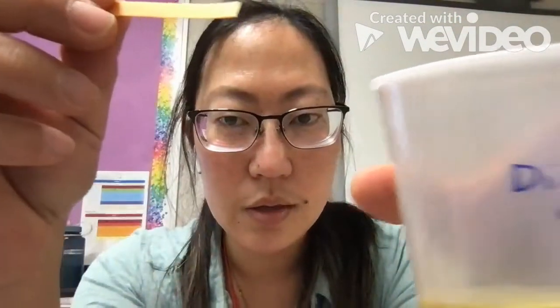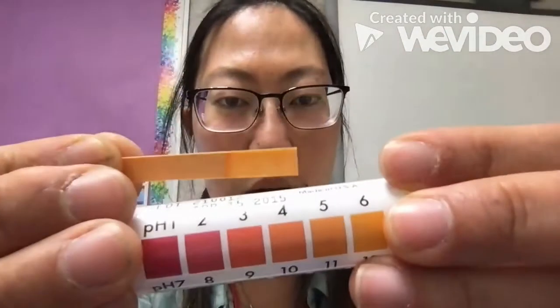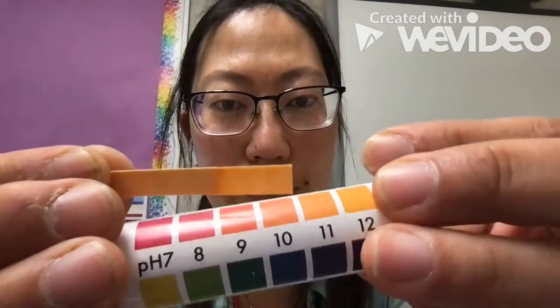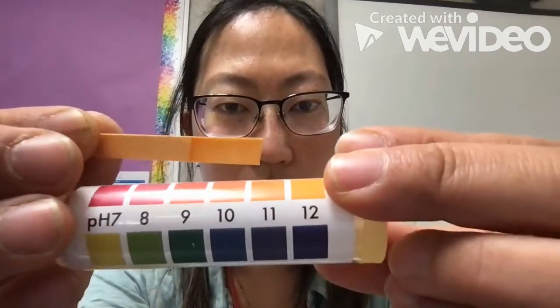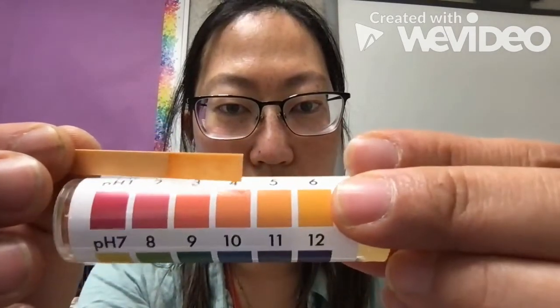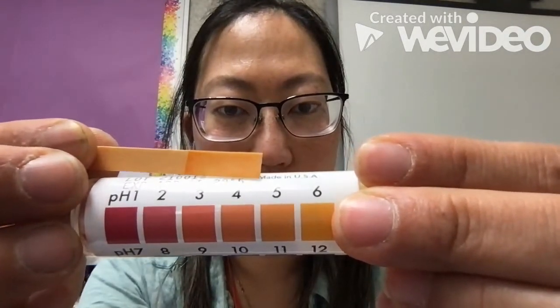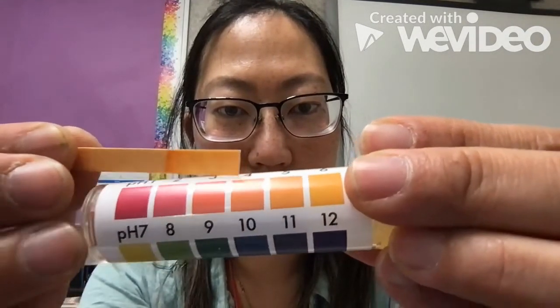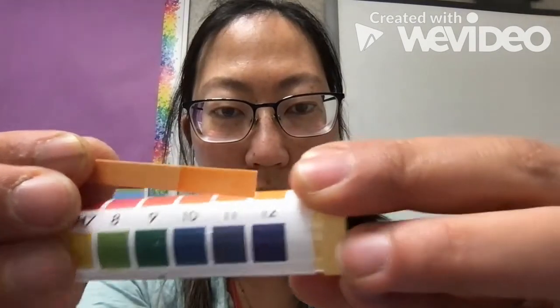To test this, I just dip this in and take it out, and then I look at the color coding here, and you can decide what pH that is. Okay, so that's distilled water.